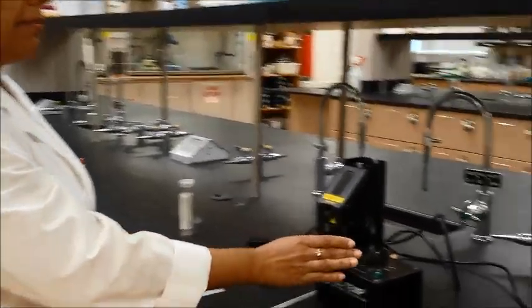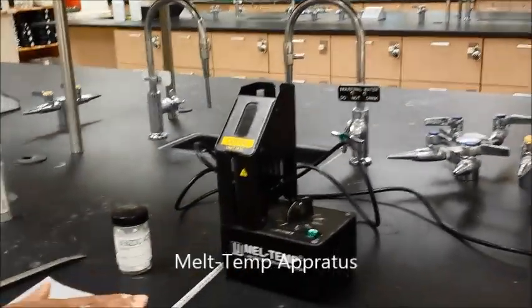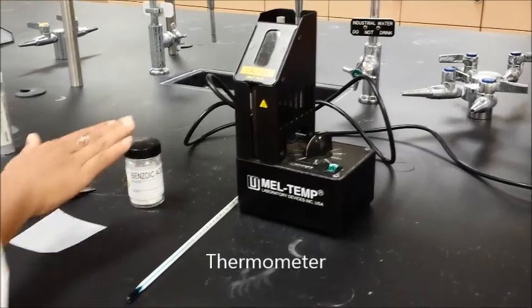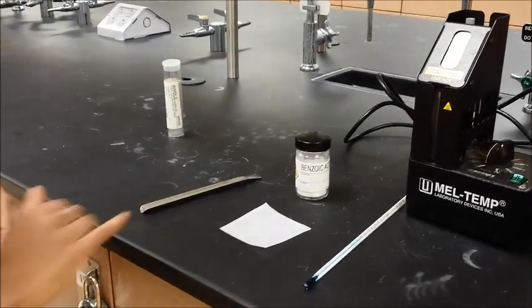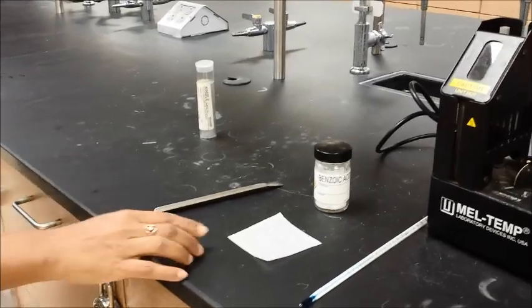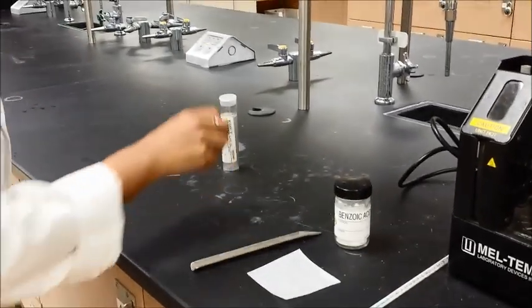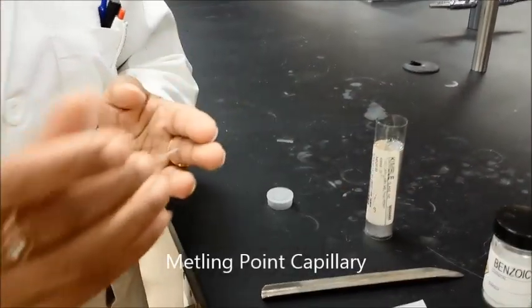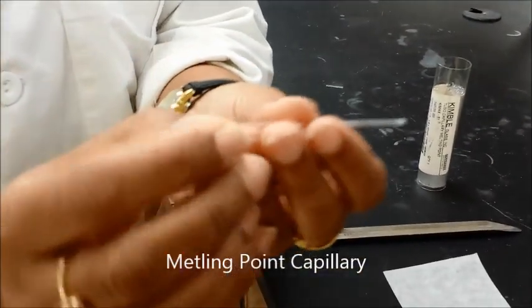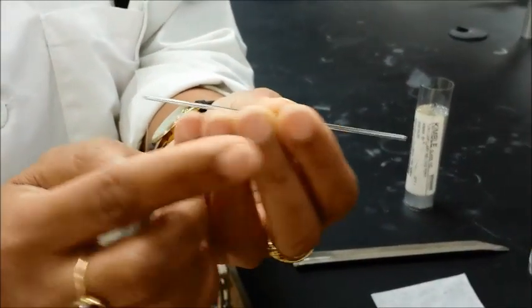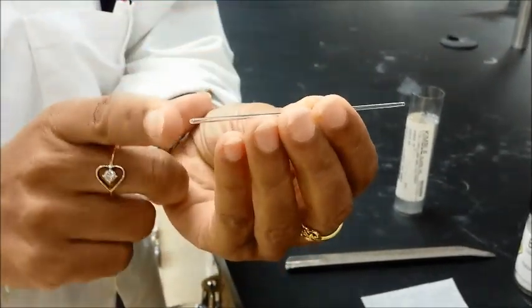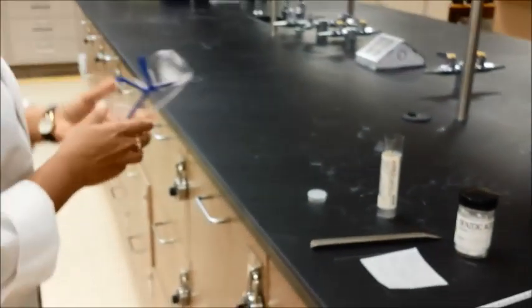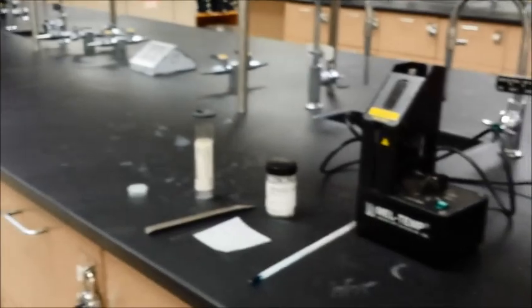You will need a melt temp apparatus, you will need a thermometer, you will need a sample, and you will need a weighing paper or a filter paper, you will need a spatula, and then you will also need a capillary which is called a melting point capillary because it's closed on one side and it's open on the other side. So you will put your sample through here and this is the closed ended side. So these are the things that you need for your melting point determination.